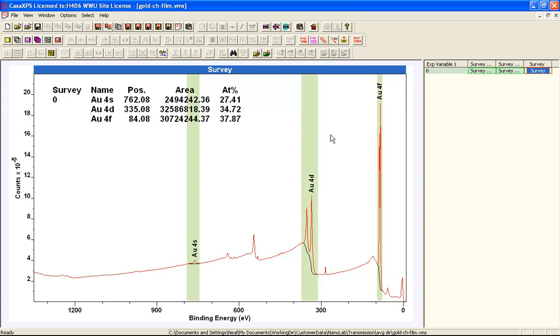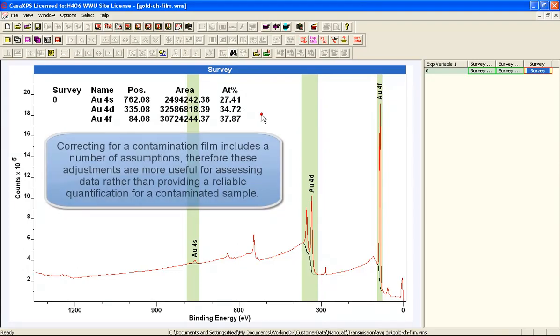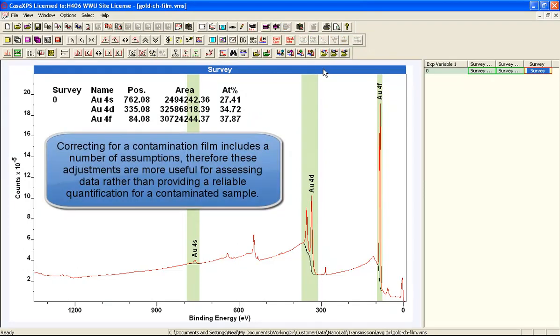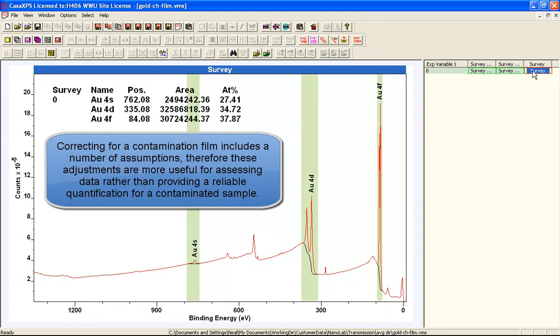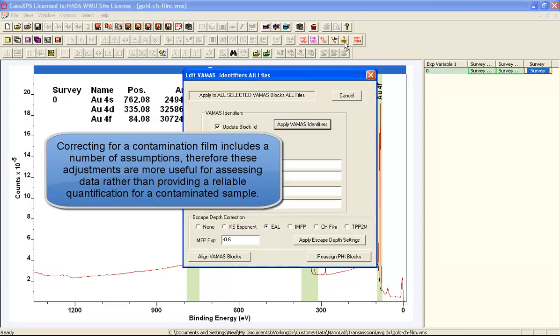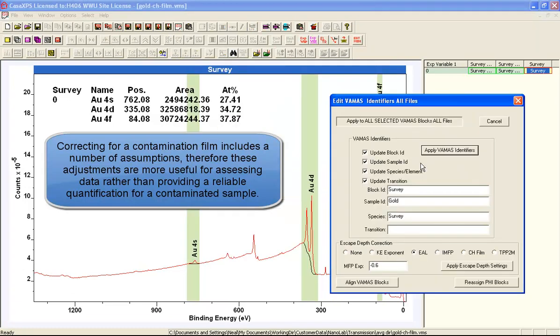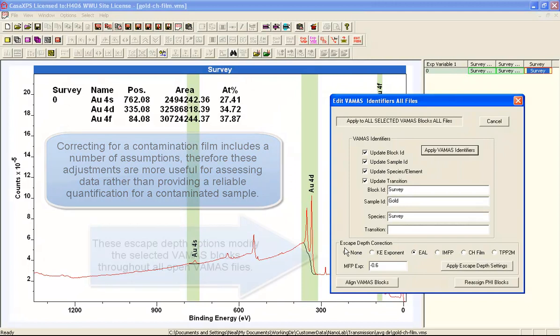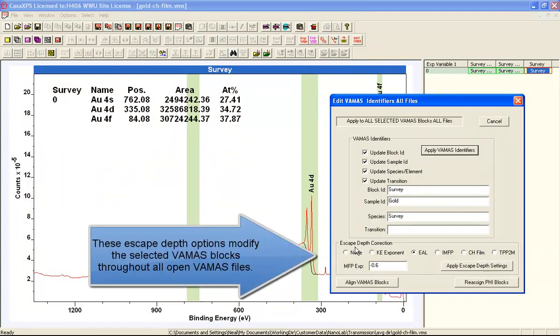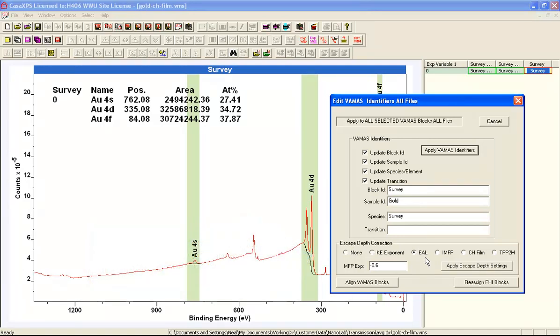So can we do anything about this? And the answer is we can. If you select in the right hand side and then select the dialog window, you end up with some options now that gives you the escape depth correction. And right now we've got effective attenuation length as the method for correcting these data.